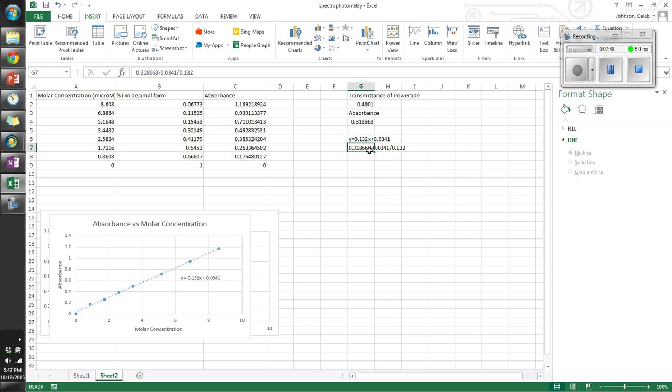And of course, if you remember, for Excel to make a calculation, you have to hit enter. Let me make sure I solved it right. Nope, of course, always remember your parentheses. Come on, PEMDAS. Okay, there you go. And there would be my precise concentration calculated from our data there. Okay, so 2.1558 micromolar. And that's pretty darn close.